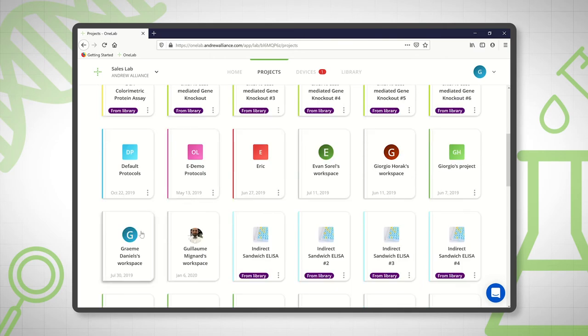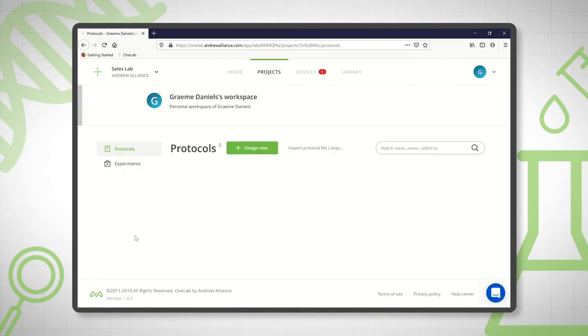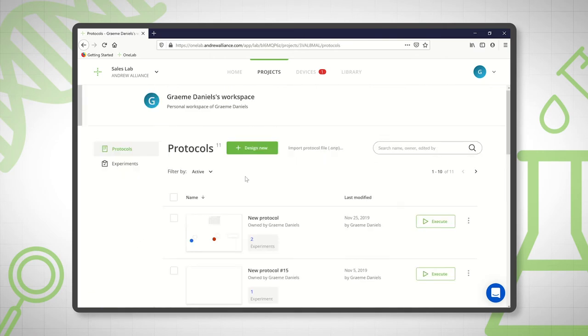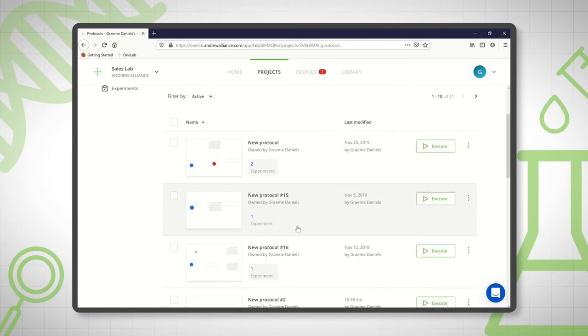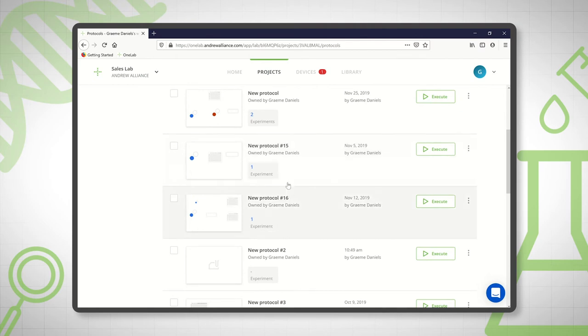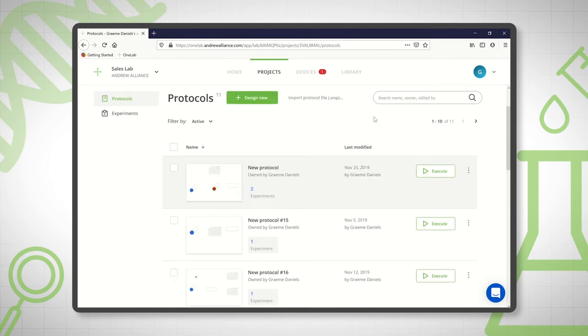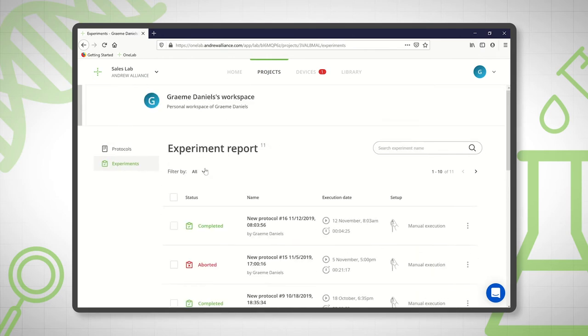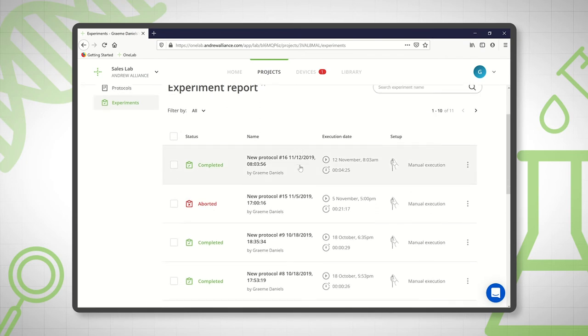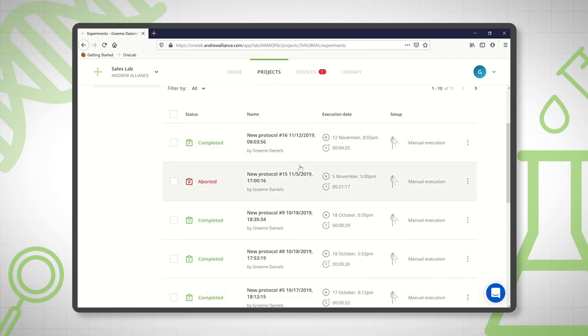So if we have a look in my workspace you can see the protocols that I have here. You can see how many times a particular protocol has been run. You can execute it from here but you can also flick over and actually see the experiments that I've run of the protocols in that project.